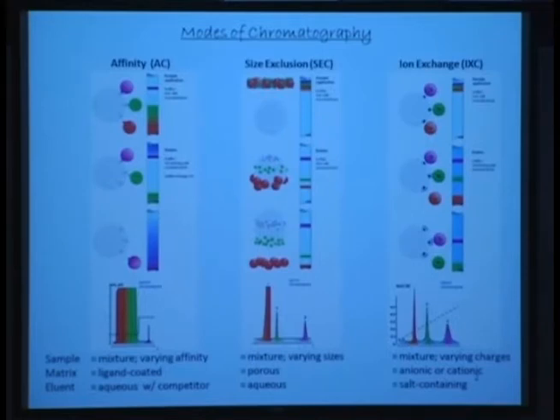Okay, ion exchange. Ion exchange chromatography, and herein is a figure that is primarily for what is coming out first. So this is positive, this is negative. So this is anion exchange chromatography.